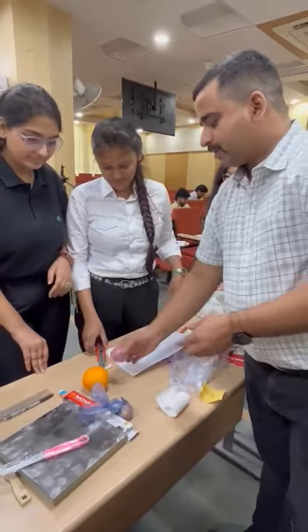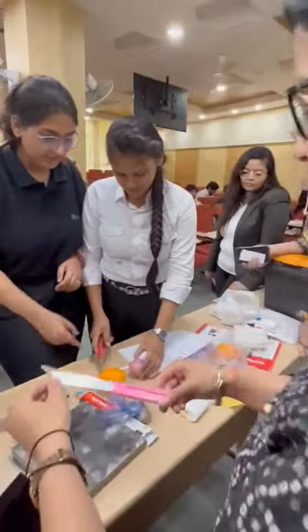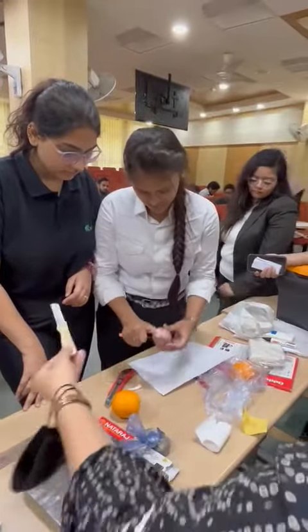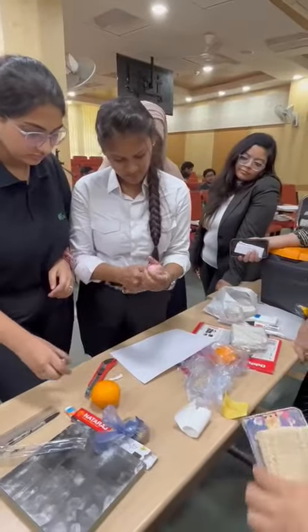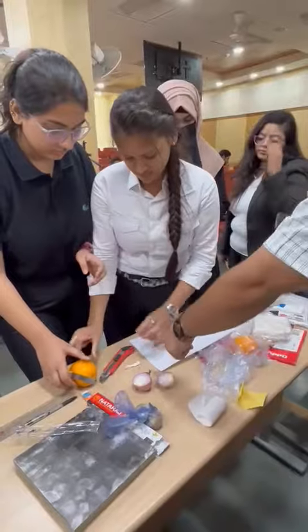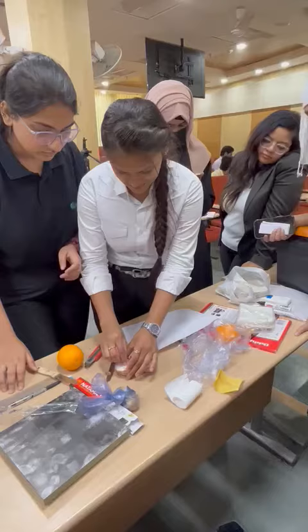Let's cut it. First, we will cut the onion. Let's dip it. You have to use the juice.